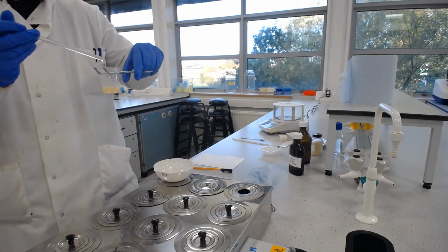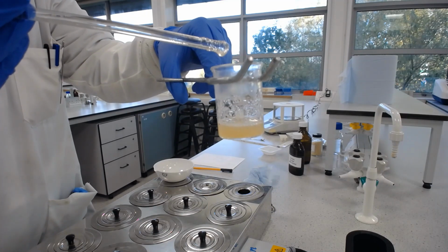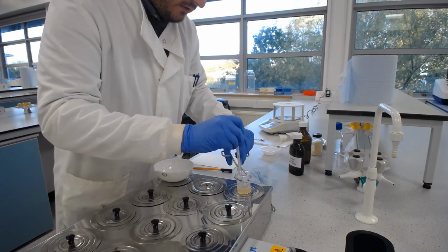Now this isn't quite there. If I bring this up to the camera, you can see that that's still grainy. We've still got some grains in there. So still need to keep working on that. But you don't want to stir it too vigorously because we don't want to get lots of air bubbles in there.